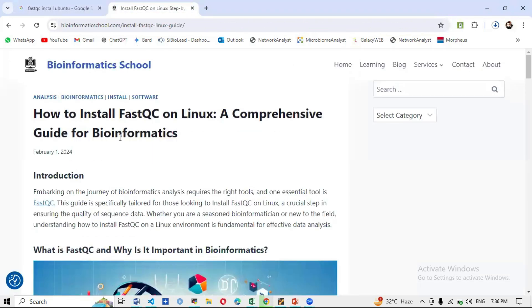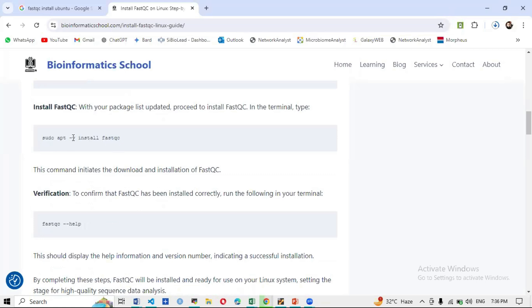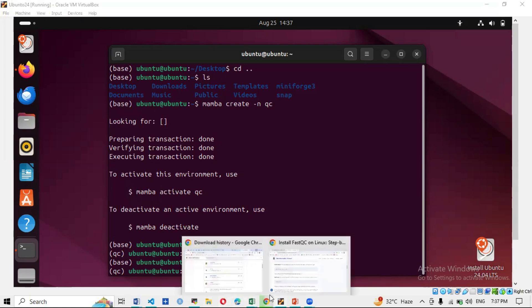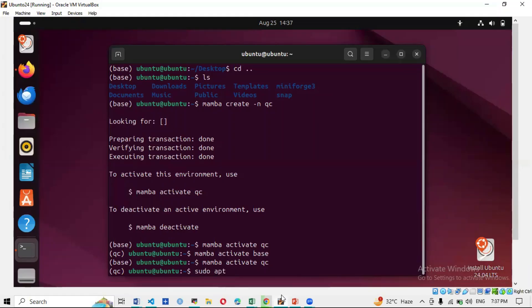The command from the link is: 'sudo apt -y install fastqc'. There are multiple commands for installing FastQC — this is one. You can also use 'mamba install fastqc', or open ChatGPT and type 'how to install fastqc in linux' for multiple options. I'll use: 'sudo apt -y install fastqc' — type it in the terminal carefully and verify it's correct before pressing Enter.